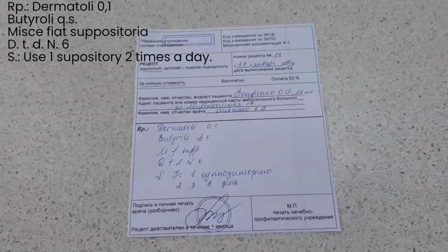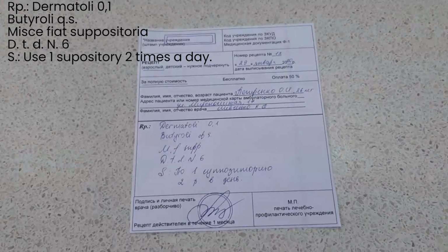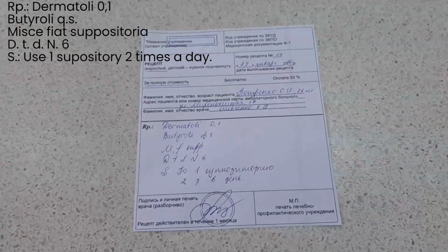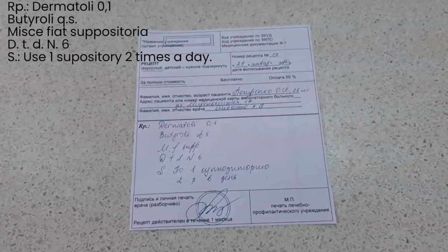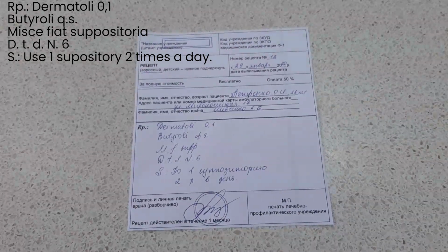The given medicine is rectal suppositories prescribed by the distribution method, which includes a substance insoluble in water and oil, dermatol, and a hydrophobic suppository base, butyrol. The ingredients of the prescription are compatible.